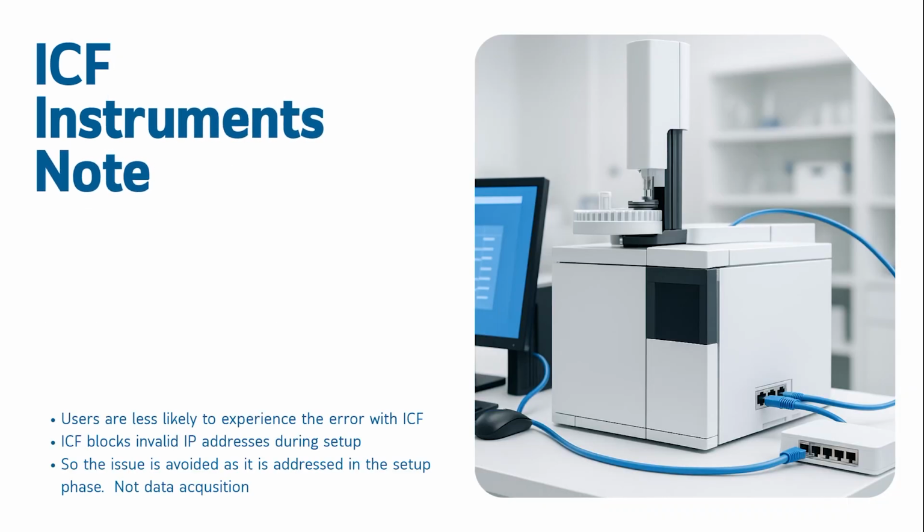This issue mainly affects Chromperfect's native Ethernet drivers. For ICF instruments such as Agilent 8890 or a Shimadzu 2030, the configurator will normally refuse the connection if the instrument IP address is not on the same network as the computer, so the problem is detected before acquisition begins.